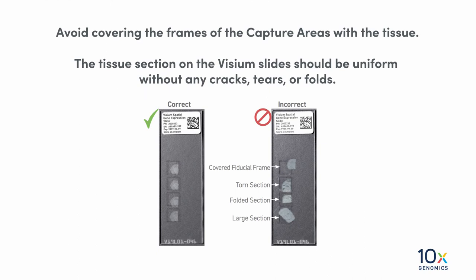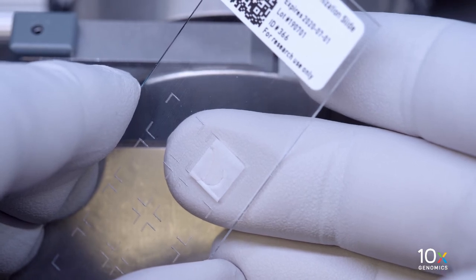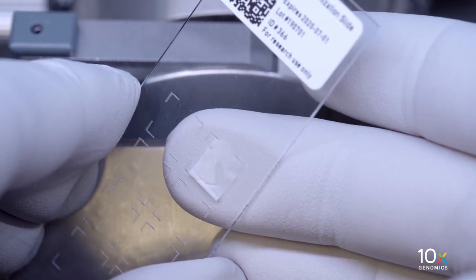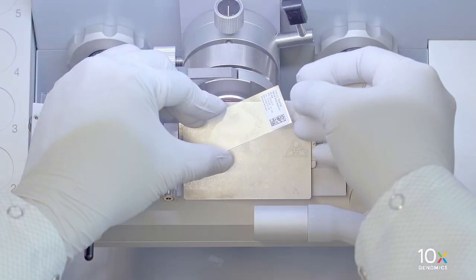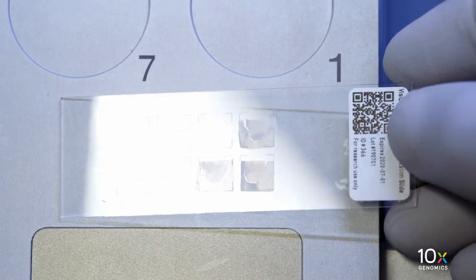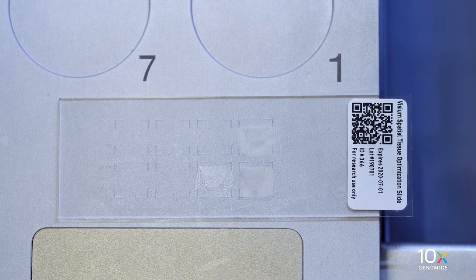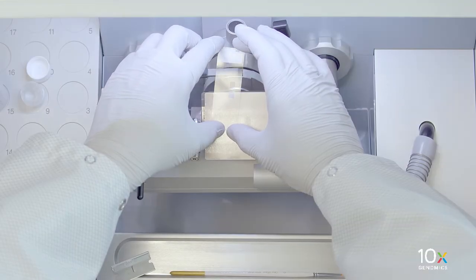Avoid covering the frames of the capture areas with the tissue. The tissue section on the Visium slides should be uniform without any cracks, tears, or folds. Immediately place a finger on the back of the capture area of the slide for a few seconds. This will allow the section to adhere to the slide. Ensure that the entire tissue section is fully adhered to the slide and the slide is inside the cryostat chamber throughout the section placement. Immediately place the slide with the tissue section on the cryobar to freeze the section. Do not remove the slide from the cryostat chamber at any point during sectioning and tissue placement.